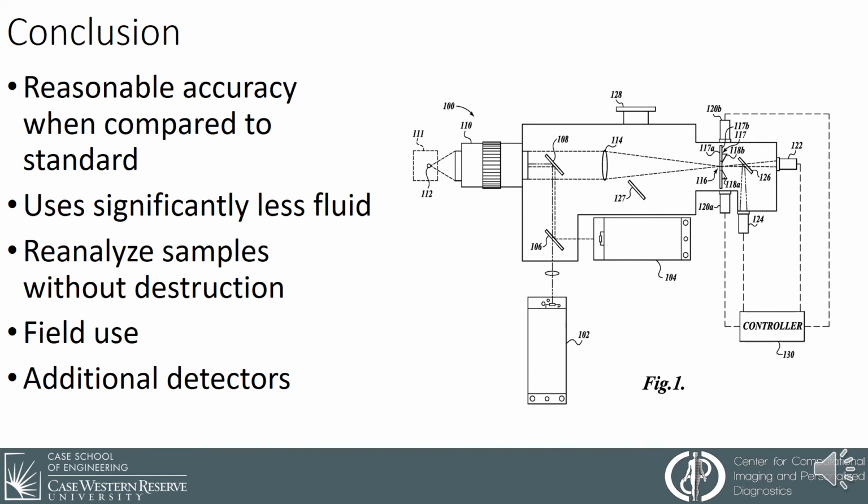This system allows for the reduction in size of flow cytometers and thus allows for the field use of these devices. One proposed method and location is within the bulkhead of ships to detect the materials found within water in the ballast tanks. A future development of this project that was considered by the authors was to increase the complexity and structure of the detectors to better ignore the false signals while more accurately resolving the true focal signals.